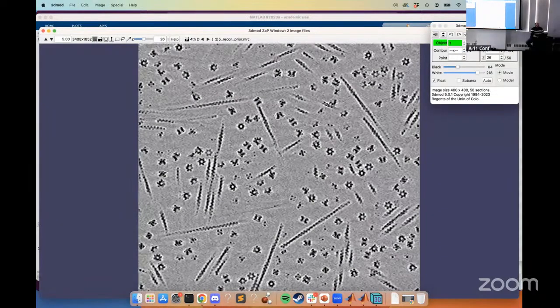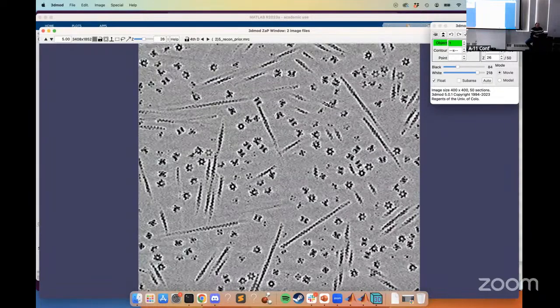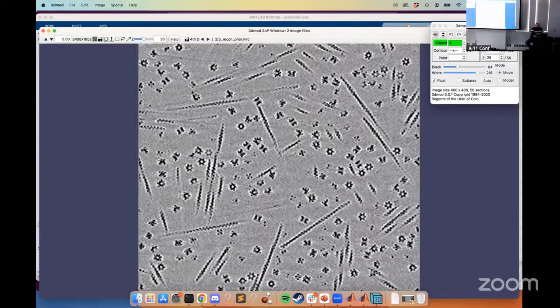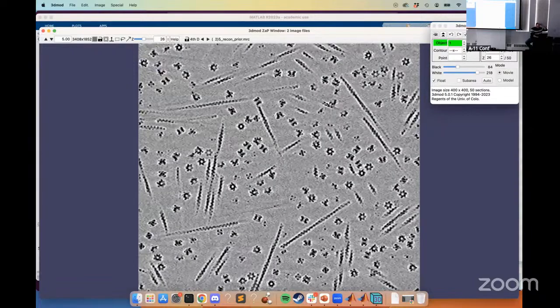All right. So now you have the noisy version and this other version, which is what we call ground truth. And those are what you bring into Dragonfly. You give it the noisy one as the input, and this is the output. Gotcha. Yeah. Thanks.